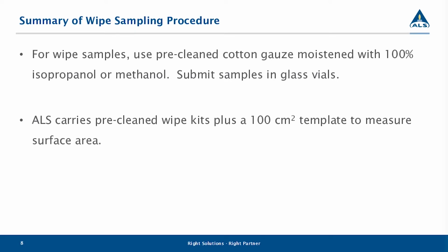We also can provide what's called a template. It's a paper template that measures 100 square centimeters. I don't know of any specific recommendations for how much surface area to test, but this is the recommendation for the surface area we think is applicable. And so you can use that template to measure how much surface area you're testing.